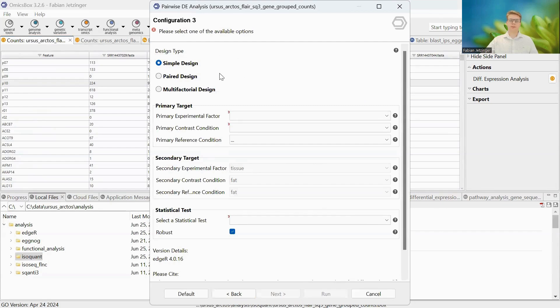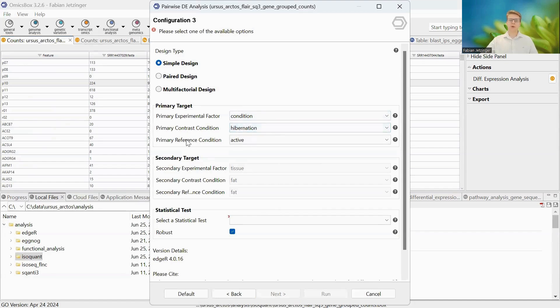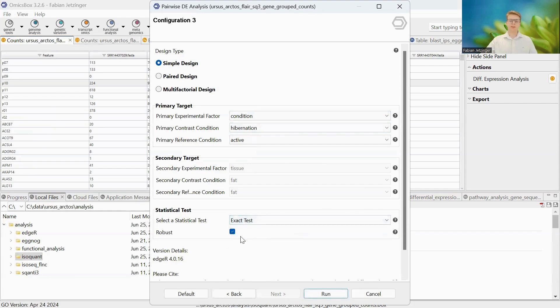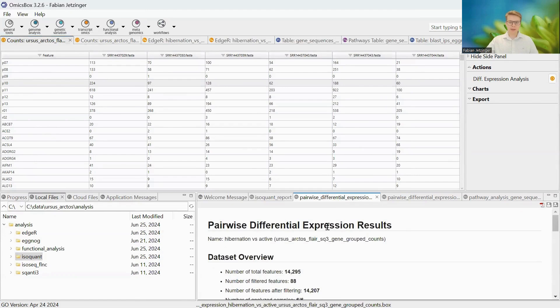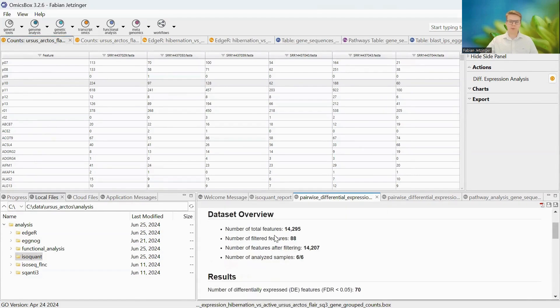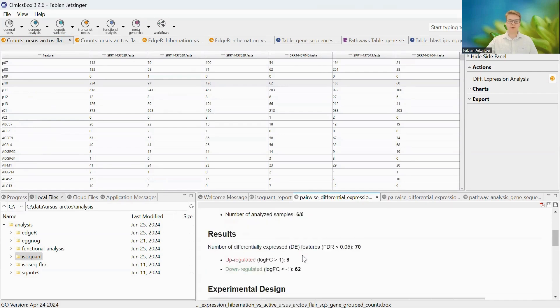We opt for a simple test design where the experimental factor is the condition defined in the experimental design. For the contrast, hibernation is selected as the test condition and active as the reference. We select a statistical test — an exact test, making it robust — and we're ready to run. I've already obtained the results ahead of time, so I can skip to those now, where we obtain a summary report with basic statistics.